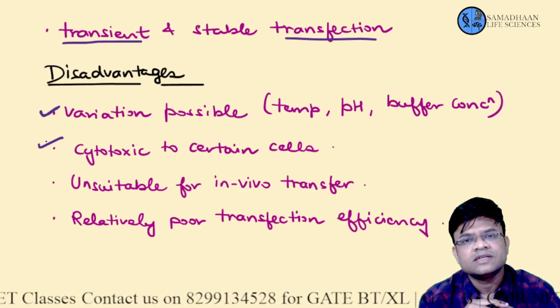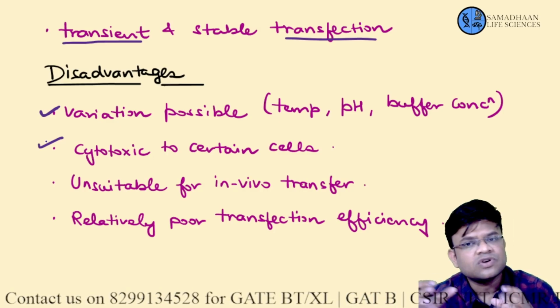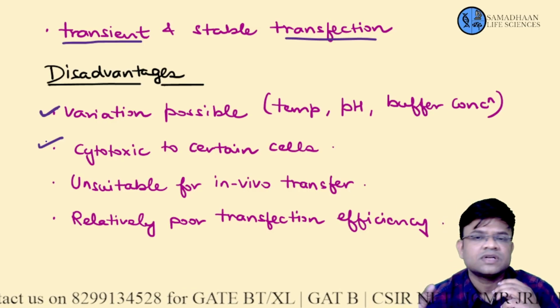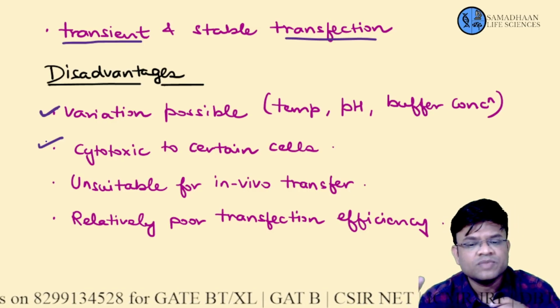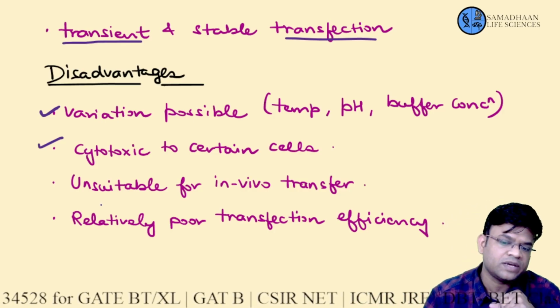Cytotoxic to certain cells. Understand this, that certain cell lines do not appreciate the use of calcium phosphate, because the calcium phosphate proves to be cytotoxic to these cell lines. So you cannot use this method for them.